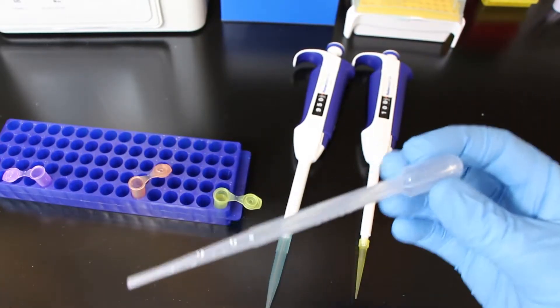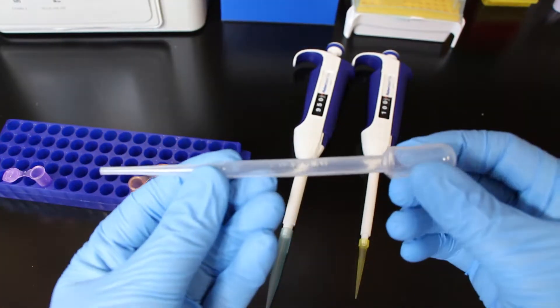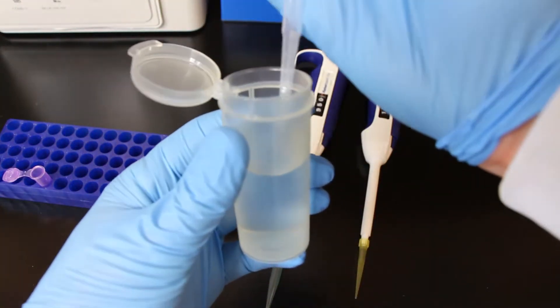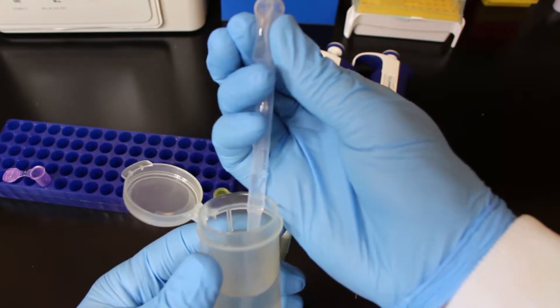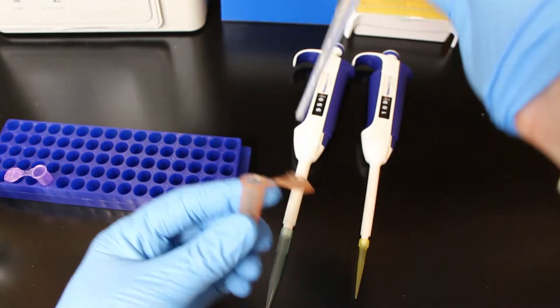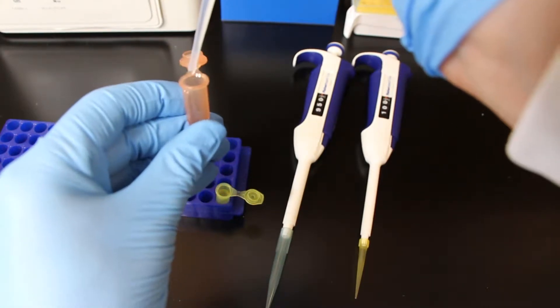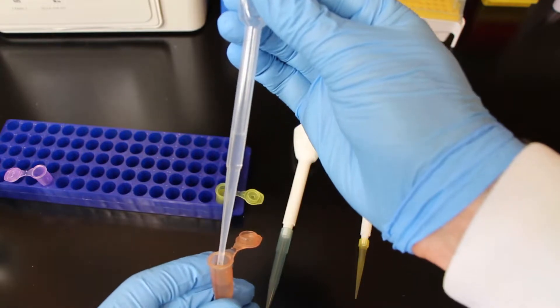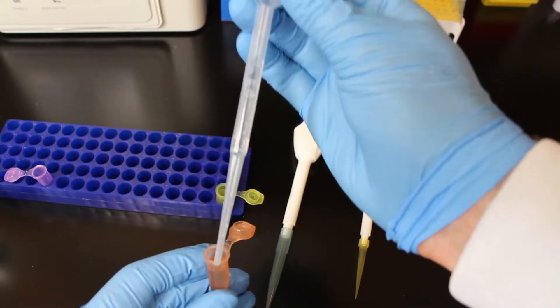These pipettes are going to be those plastic ones that are one-time use. All you do is you squeeze a little bulb, you put it into the sample, you slowly release your squeeze, and then you pull it out of the sample. Then you take it to wherever you're going to put the liquid, so whatever sample container you're putting the liquid into, put the tip of the pipette in and slowly squeeze all the liquid out, and then pull it out.